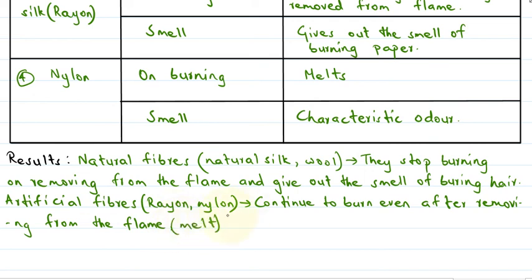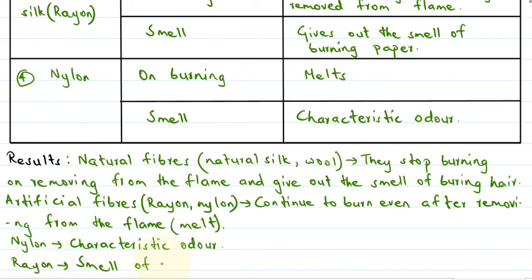We have seen that nylon even melts. And nylon has a characteristic odor, and rayon has the smell of burning paper. Okay, these are the results.